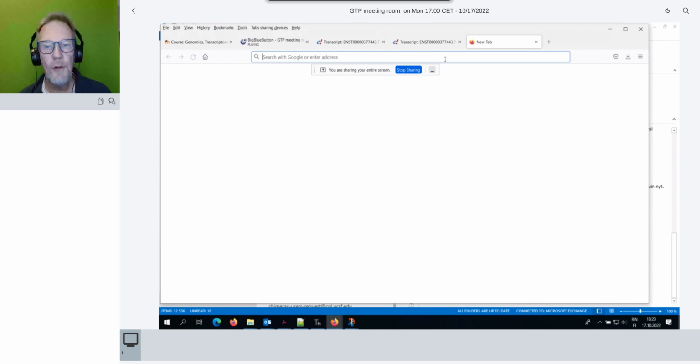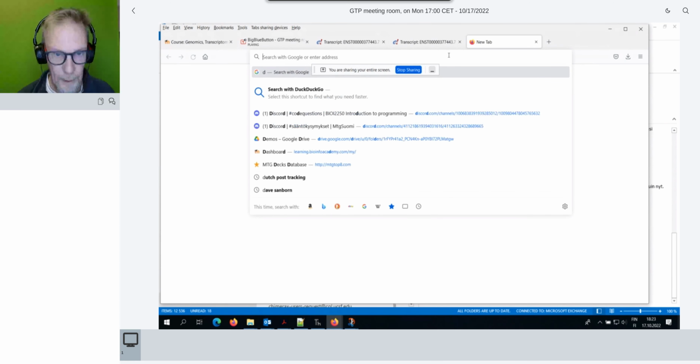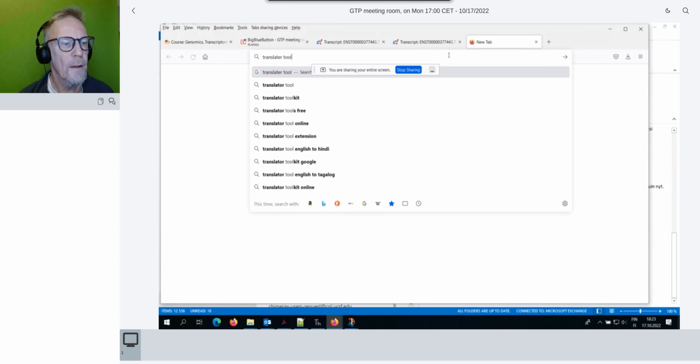And I'm copying this, and to verify how it looks, I'll go to, not Google Translate, but the ExPASy translate tool.